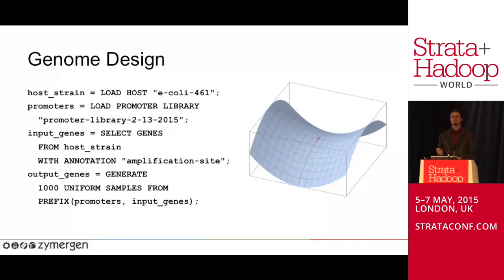And finally, Helix provides a powerful set of genome design tools to our scientists. The old-fashioned mechanism of specifying precisely and literally which genomic changes that you want to make doesn't scale if you have to devote resources to designing thousands of genomes at a time. So we provide declarative tools that allow scientists to, say, take cross products of different libraries of promoters or other genomic components and attach them in series to each of the different locations where they might be applicable in the genome. We then construct all of these in turn to determine which are the effective locations.